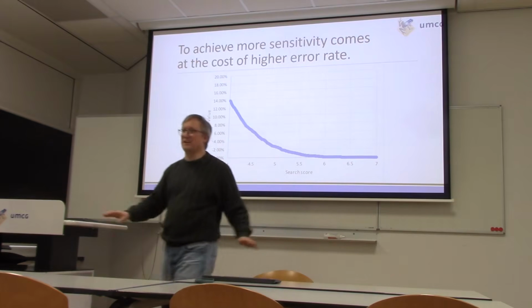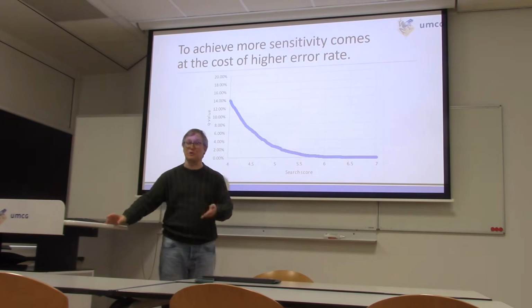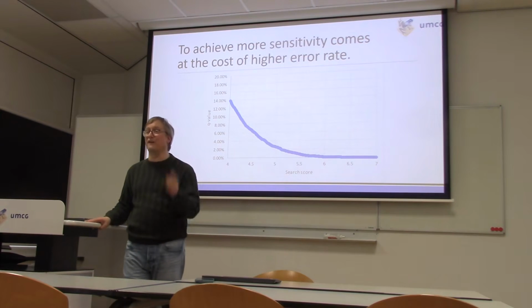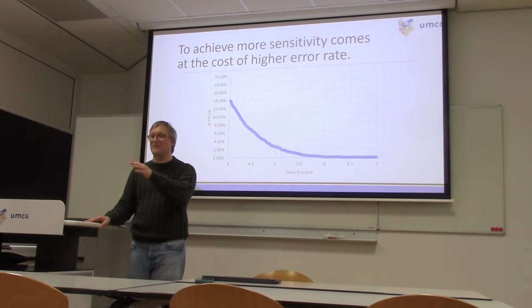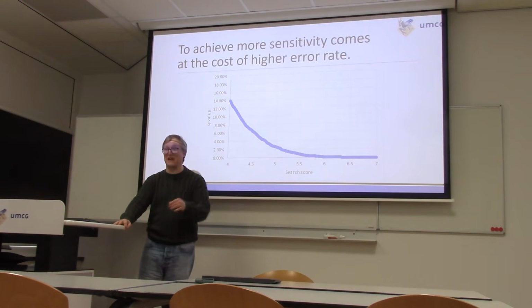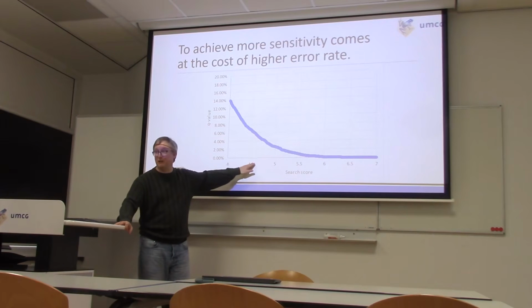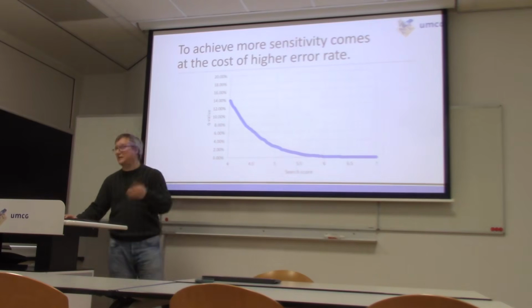We love this. But the reality is that we have to be rather careful in how we control false discovery rates, because you don't want to send some PhD on a 5-year mission to chase a false positive. We can agree this is a bad outcome. We don't want to waste researcher time and resources on something that's a false match. So we have to be careful that we limit our error rates among our identifications to a trusted set of identifications.